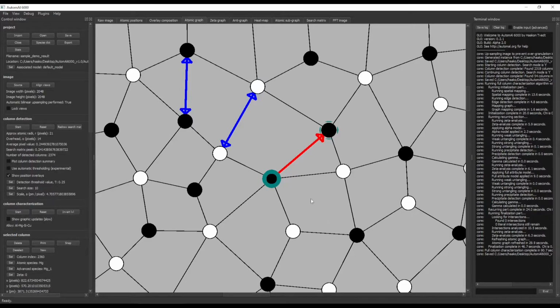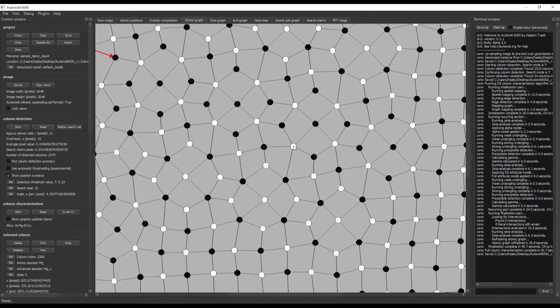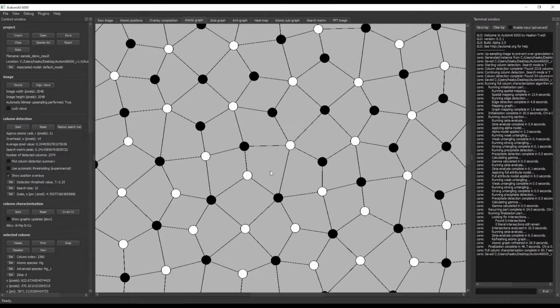But first I wanted to talk a little bit about the structural principles that are in these types of precipitates and systems. These principles are the reason why this algorithm works, which means that I wouldn't have known about the method for how to determine the structure without any structural principles.